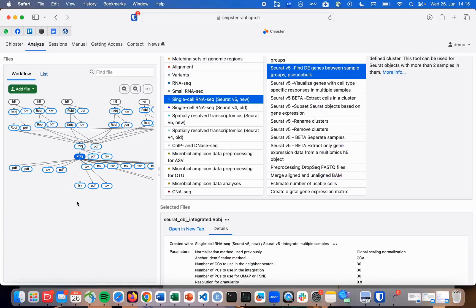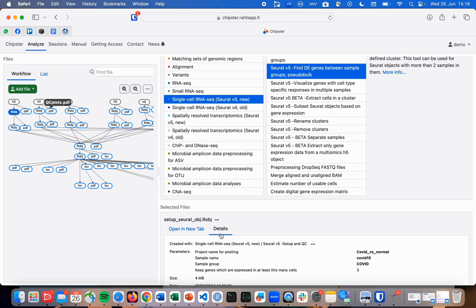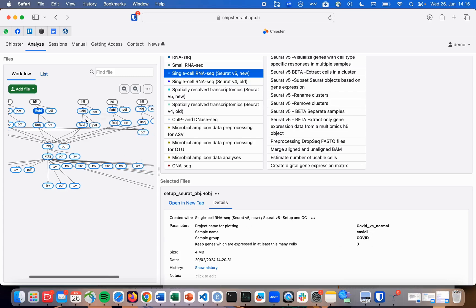How to run pseudobulk analysis in Chipster. We are starting again with the combined and integrated Seurat object. Note that the pseudobulk tool now expects that you have several replicates from the two sample groups you wish to compare. It is important that those sample groups are marked here in the setup phase. In this example, we have three replicates in the COVID group and three in the normal or control group.